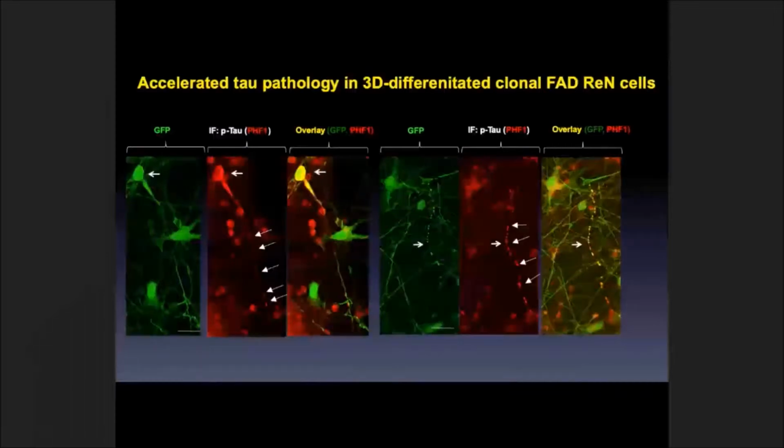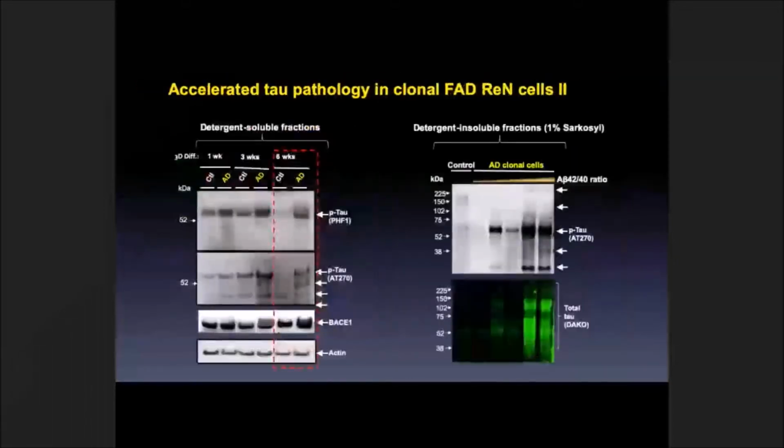So it actually seems like when the neurites have high levels of tau accumulation in the tangle, the neurites also degenerate at the same time. And this is not really surprising, because that's what we think of as the tangle pathway connecting to neurodegeneration in Alzheimer's patients. And this is Western blot.